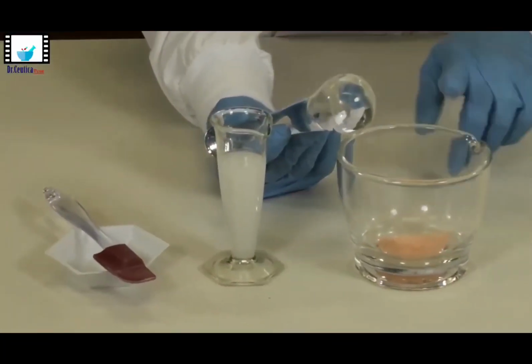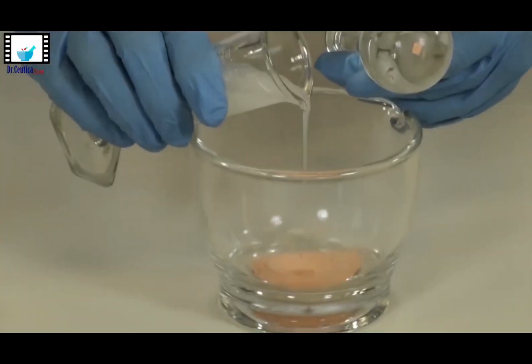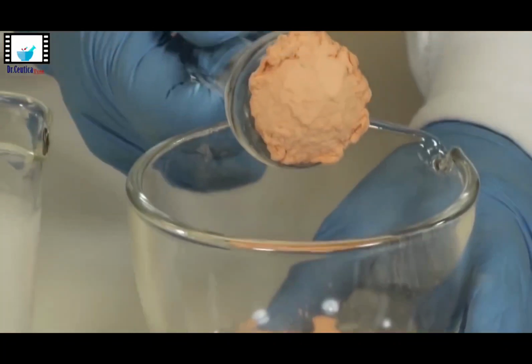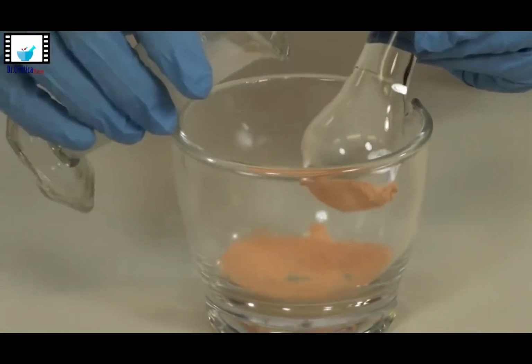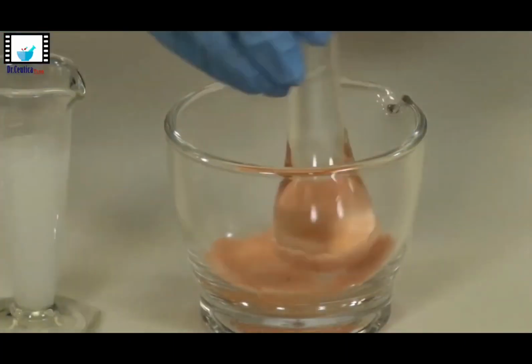So for adding the liquid suspending agent, we put the pestle in the middle of the mortar and then we press gently to create a hole. We add some of the suspending agent there and then we'll start triturating gently. If you see that it's sticking on the pestle, don't panic, it's okay. Continue adding the suspending agent and stirring gently.